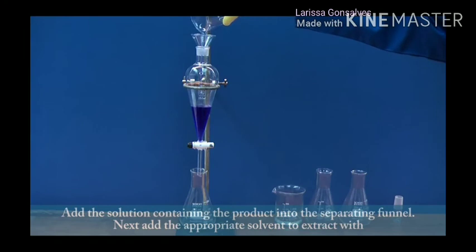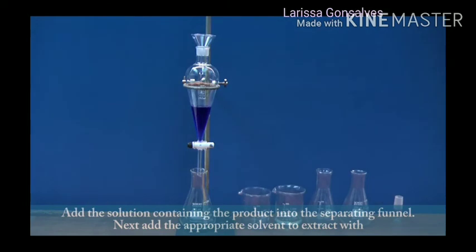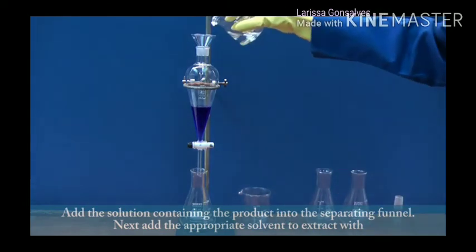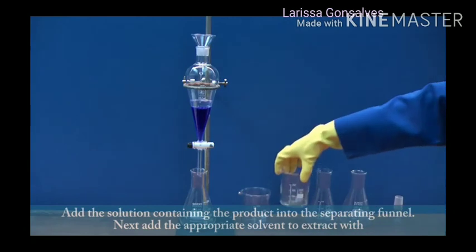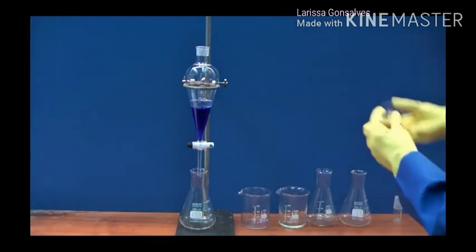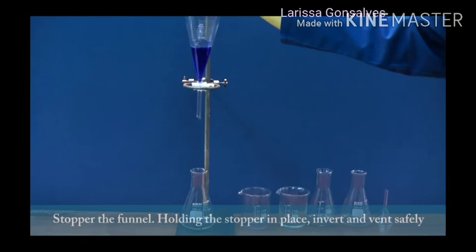Through the funnel, the aqueous solution is added into the separating funnel. The aqueous solution contains an organic substance. So now we need to separate the organic substance present in the aqueous solution. So we are adding an organic solvent. The funnel is removed from the separating funnel and the separating funnel is closed with the help of a stopper.